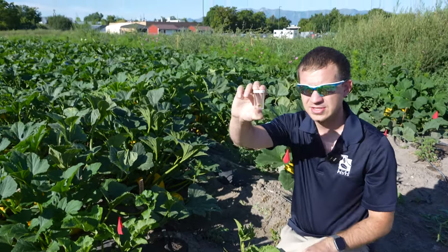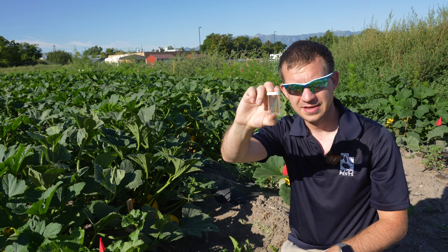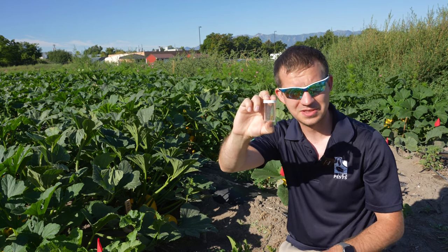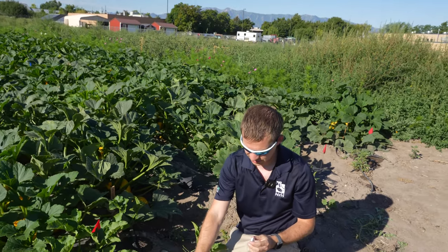I've collected it into this container and now it is safe to be transported or sent. In this particular case, we do not need to submit this bee anywhere because we know that bees are helpful, so I'm just going to release it back onto the flower.